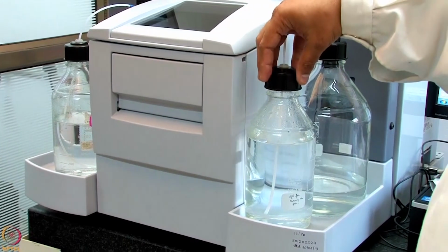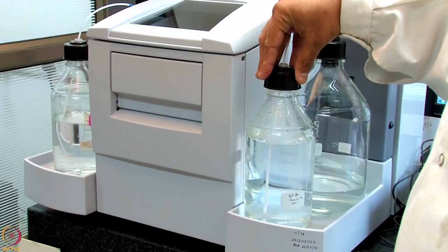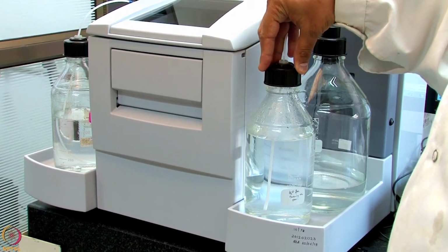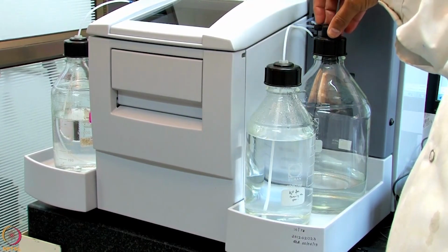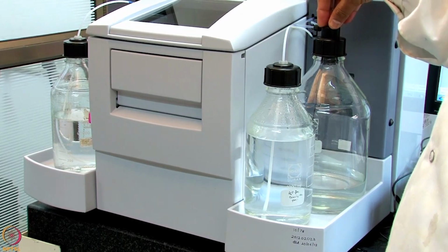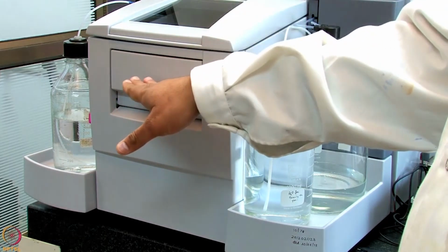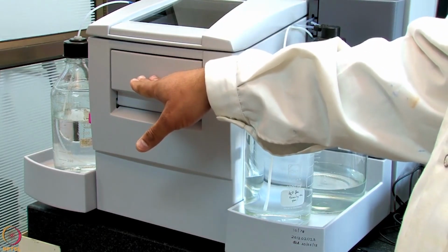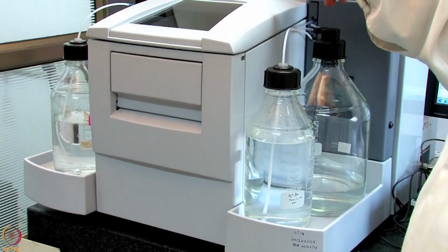Coming here, we have a water reservoir. The water reservoir is useful for cleaning needles and syringe. And we have a waste reservoir here. And this waste reservoir collects all the waste. The samples are actually sent in this compartment. Chip is docked at this compartment.